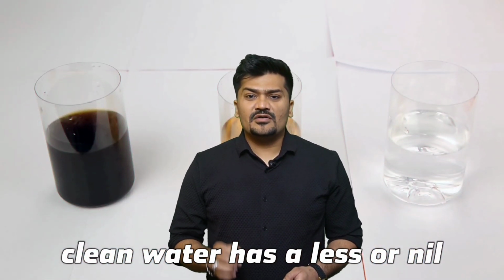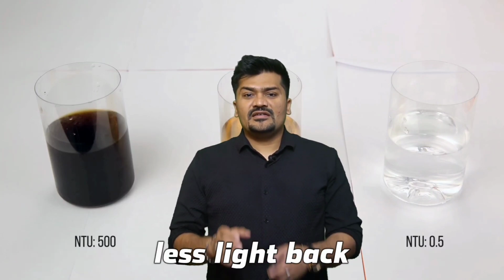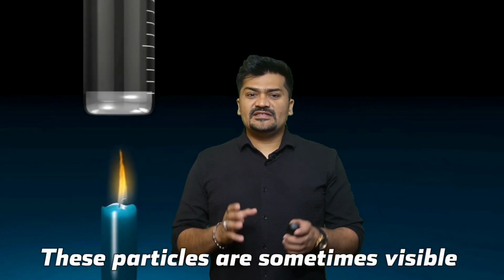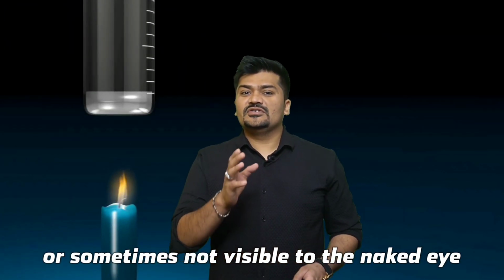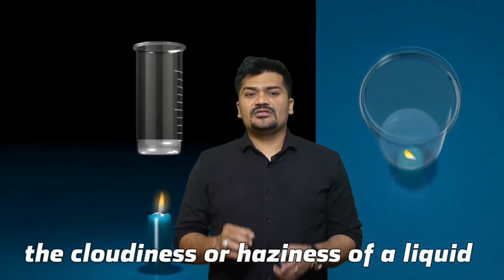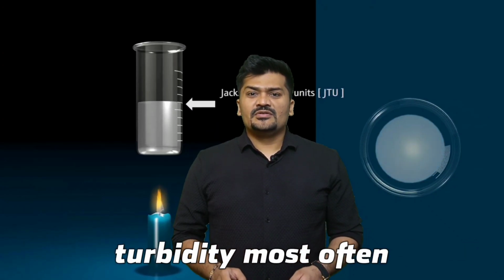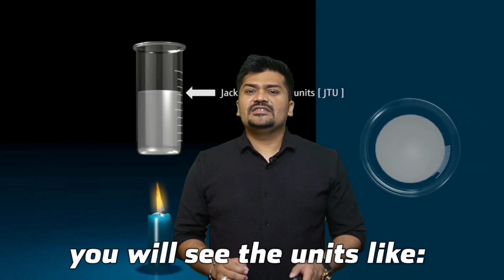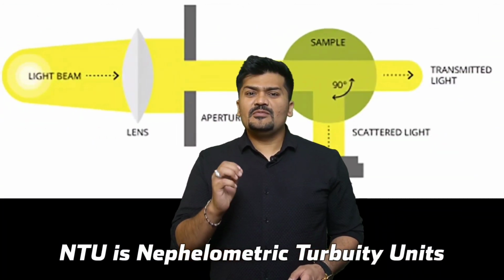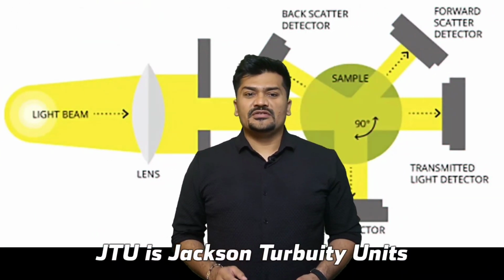Clean water has less or nil amount of particles on the surface, and thus it will reflect less light back. These particles are sometimes visible or sometimes not visible to the naked eye. Turbidity sensors are used to measure the cloudiness or the haziness of the liquid. When measuring turbidity, most often you will see units like NTU or JTU. NTU is nephelometric turbidity unit and JTU is Jackson turbidity unit.